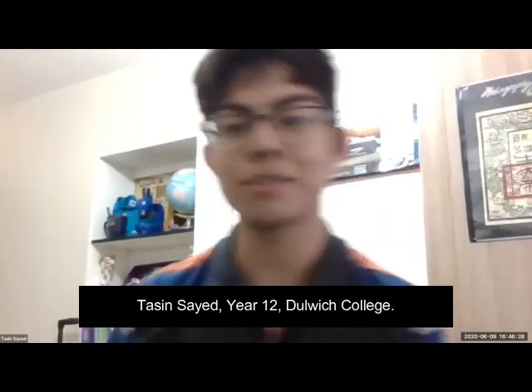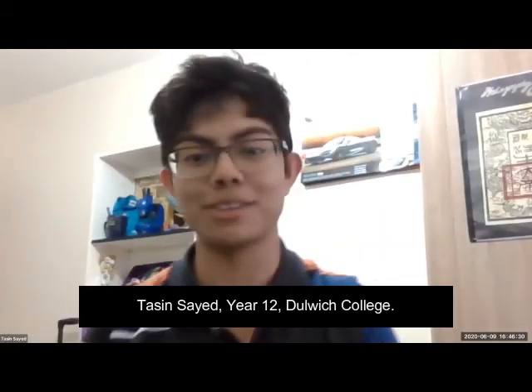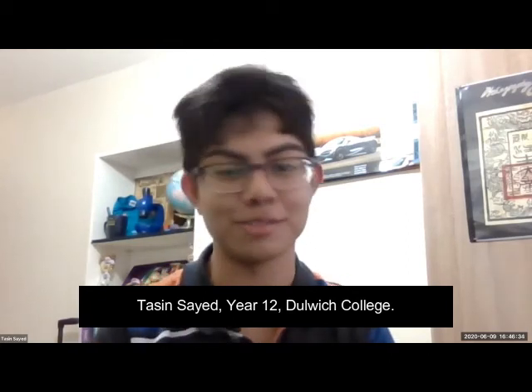Okay, thank you very much for listening. That was a very interesting talk by Dr. Reed. I especially realized how versatile and the variety of uses that infrared really has. So I guess we'll move on to a few questions.